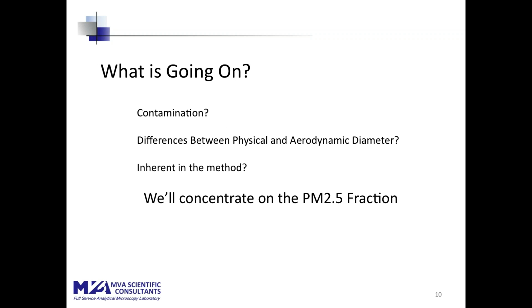3 possibilities to explain this phenomenon suggest themselves. One is contamination, that the samples have been contaminated and material from outside the stack being tested has made it into the sample either during sampling, sample preparation, or sample weighing.